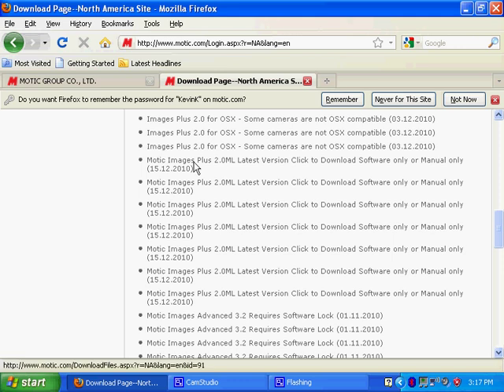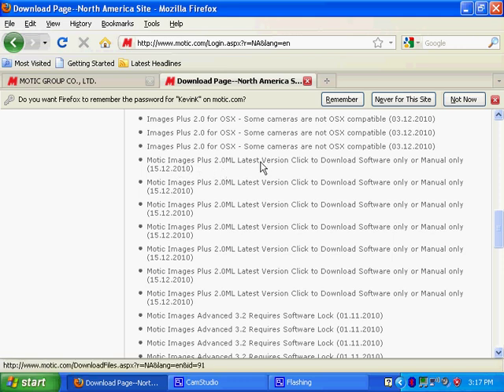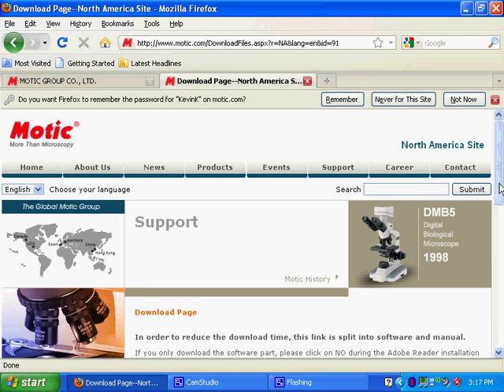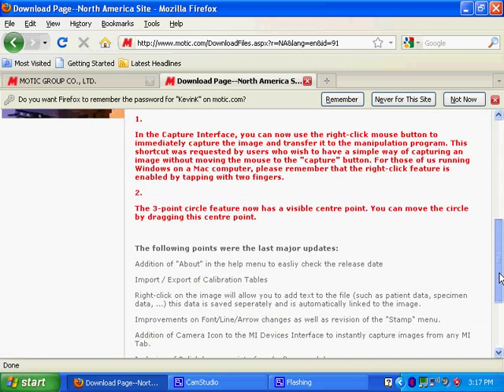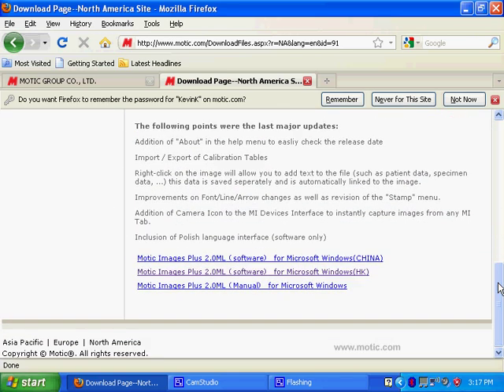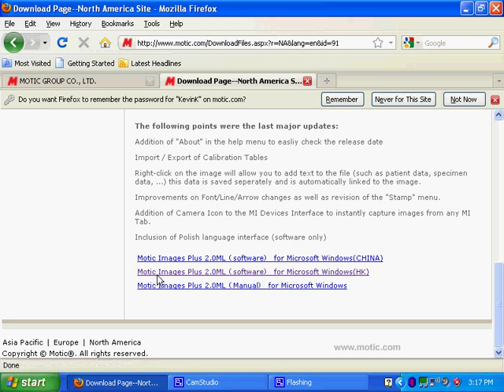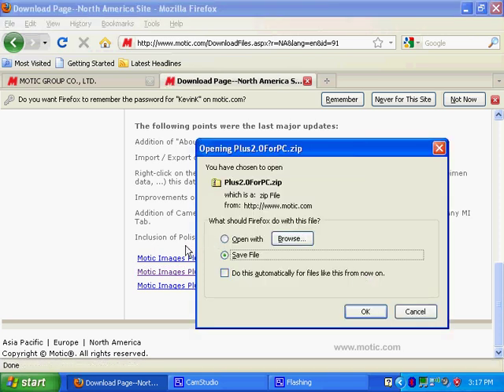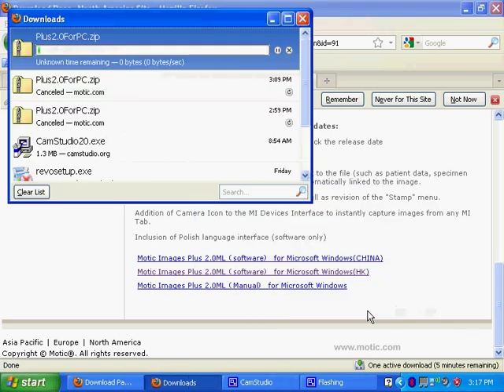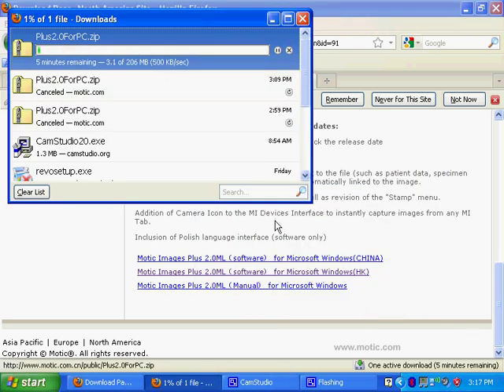Click on the latest version, Motic Images Plus 2.0 latest version. Once you get on the download web page here there will be three links on the bottom. The one you want is the one in the middle, Motic Images plus software, bracket HK. Click on that, save it to your desktop if you can.